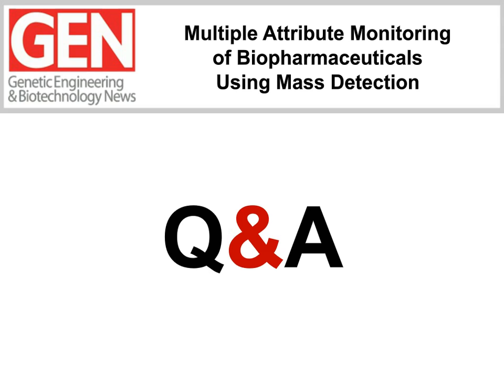And the difference between those two experiments really isn't the mass load on the column. So the QDA will require a slightly higher mass load, and it's generally in exactly the same realm as you would inject onto a chromatographic column for an optical-based assay. So it wouldn't necessarily require a change in the current protocols, just simply adding a mass detection.